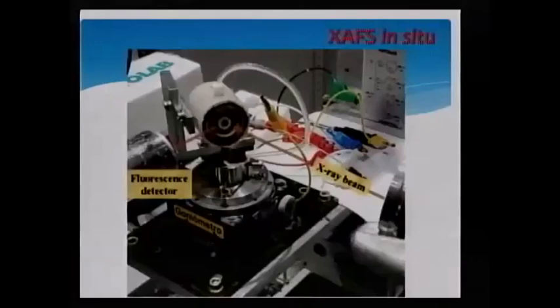Well, this is again our cell, but now we are performing an experiment with X-rays. So we put a polymer in place of the solid windows, and we study the absorption of X-rays in a model material. Hopefully next year we will be performing an experiment with several semiconductors.